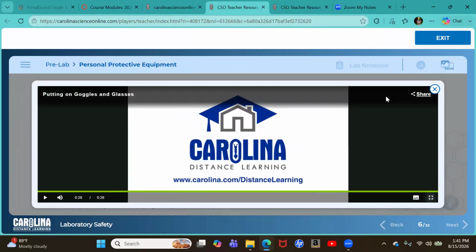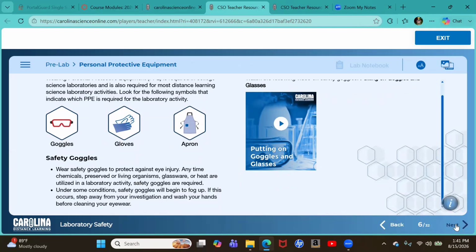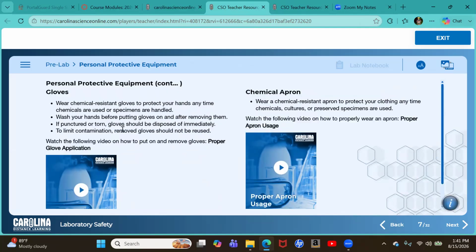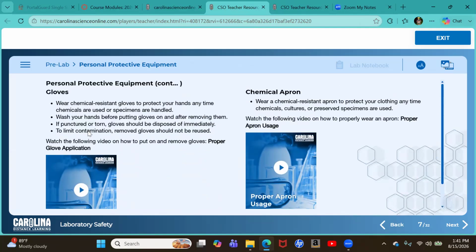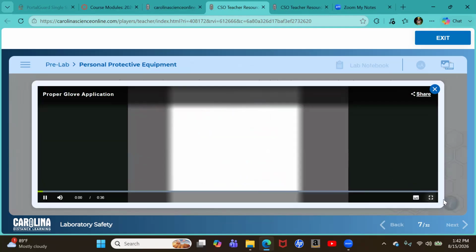Okay. So pretty straightforward there. If your kit's like mine, I have the goggles. You may have the safety glasses. Either way, you must wear them when you are working with your specimens. You must also wear your gloves. Wearing proper gloves and washing your hands before and after putting on gloves is very important. If you puncture your gloves or tear your gloves, you need to dispose of them immediately and wash your hands. Please be careful when you are working with your lab kit. Let's watch this video here on proper gloves.